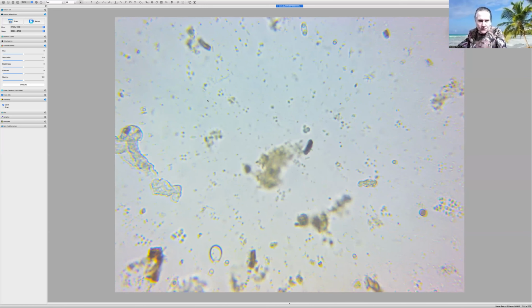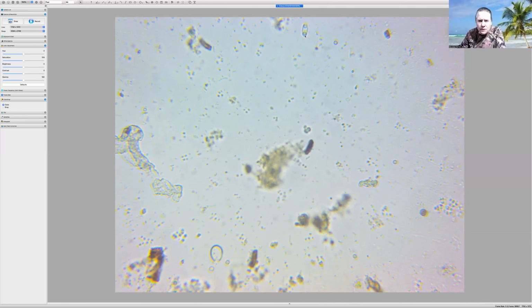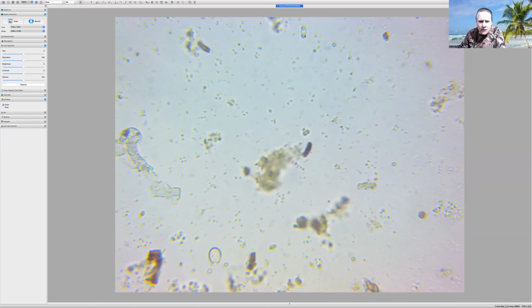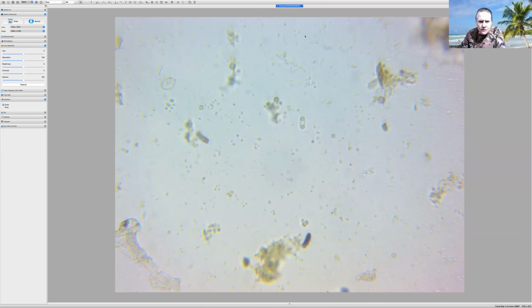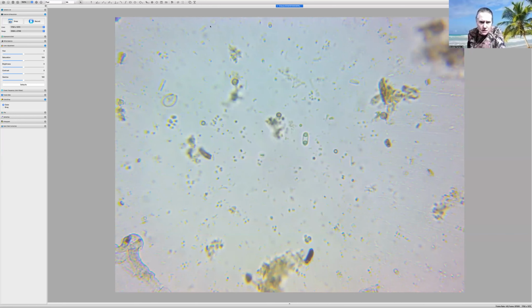I think for biocomplete status, there has to be 15. Here is something, diplo, it's binary fission here. See, that's 2 different cells. Now they're going to divide here and create more. Here is another, looks like a flagellate there.